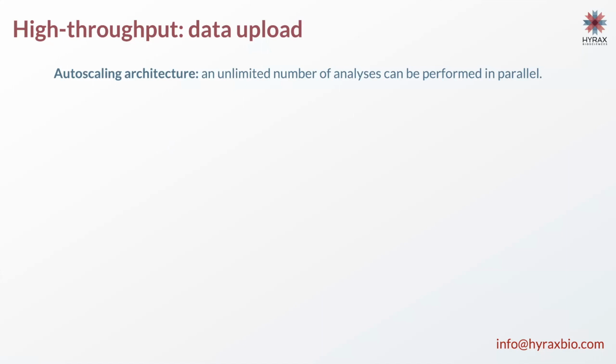One of the key things to see is that Imogen has been doing that upload and has been processing the data through a website, and we are currently hosted in the cloud. And what that means is we have deployed Exatype as auto-scaling architecture. What that means practically for you is that when you upload data to your account, or you do a run, as we call it, that is given its own dedicated computer.